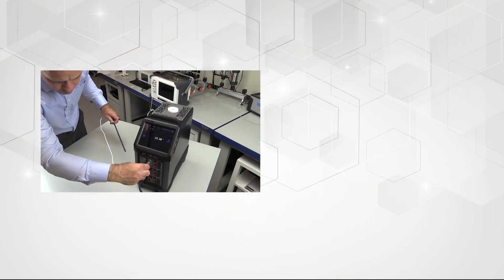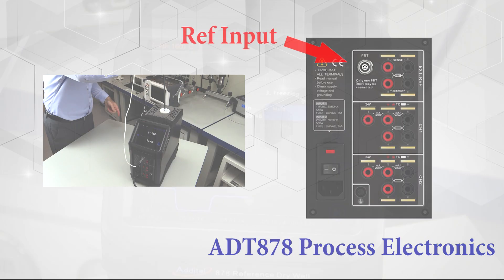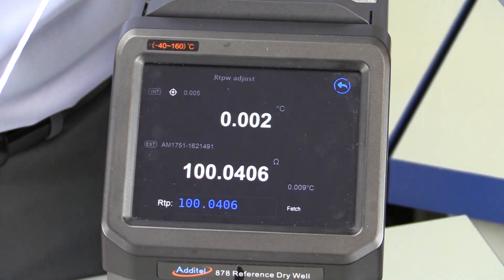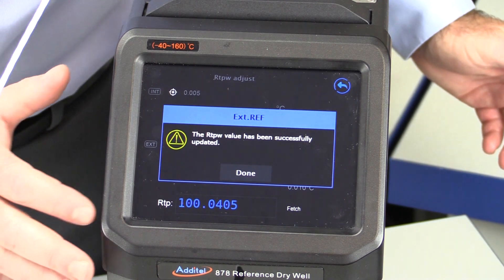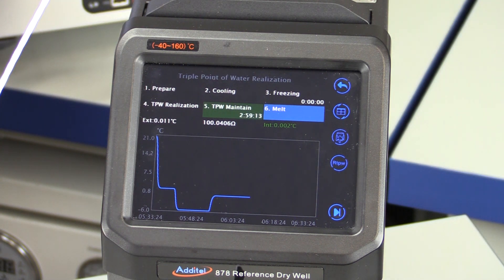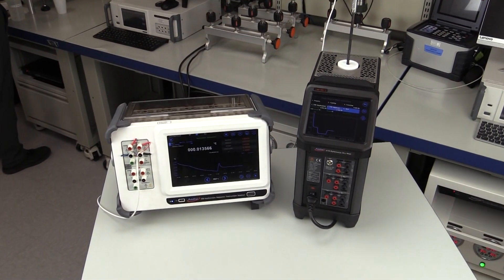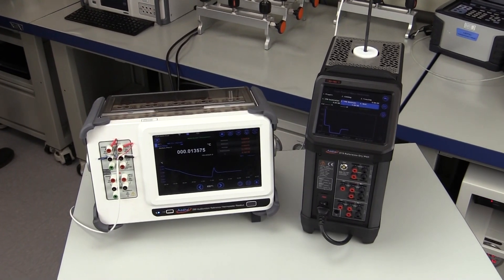When using a reference thermometer being read through the process option of the ADT878, a triple point of water icon illuminates after stabilization. Selecting this icon, the RTPW function will allow you to automatically fetch and update the resistance at the triple point of water value in the smart connector of your reference thermometer. The triple point of water is a great way to build a history with critical temperature devices and can also be used to verify the temperature probe before and after highly critical temperature work to provide added evidence of proper calibration measurements.